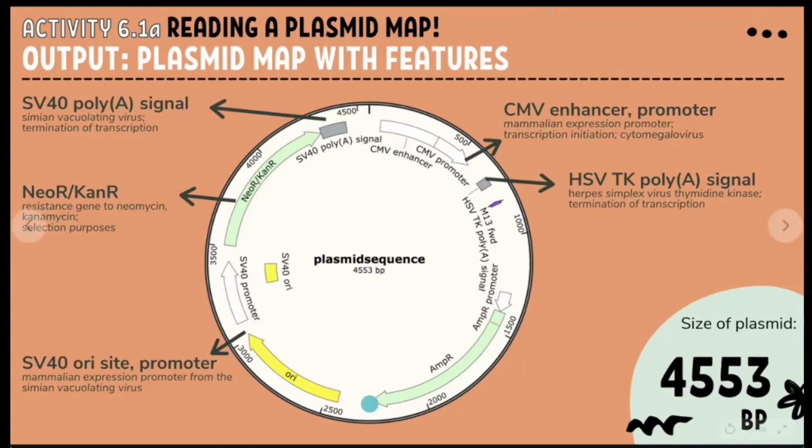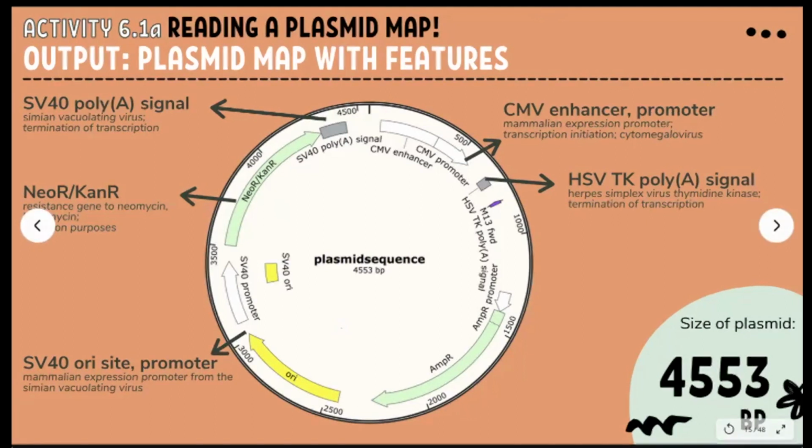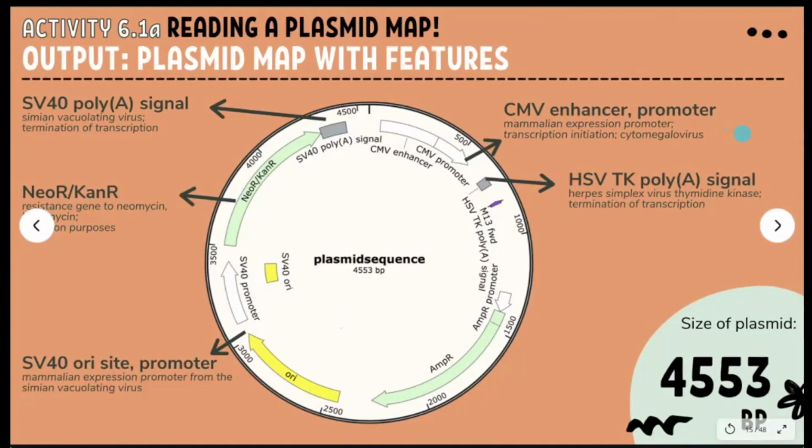As mentioned earlier, these help in selection as the bacteria is pressured to keep the plasmid for antibiotic resistance and could also help the researchers identify plasmid-containing bacteria.